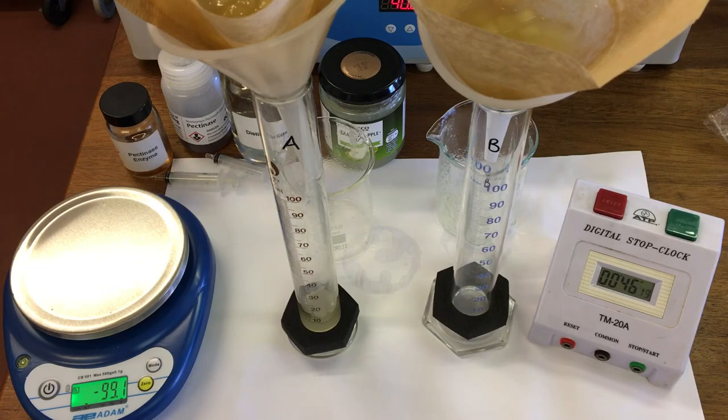We're going to take a look and see how much of the apple juice has run through after 1 minute. So after 1 minute we've got 10 mL in A.